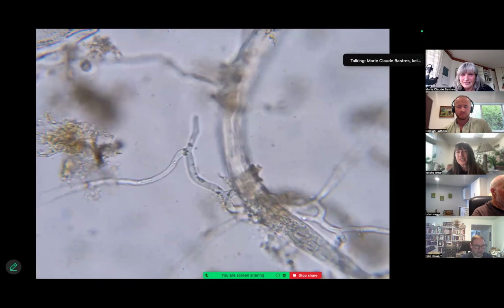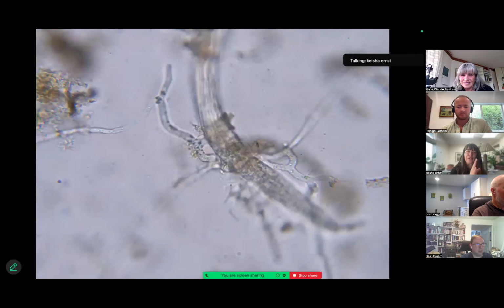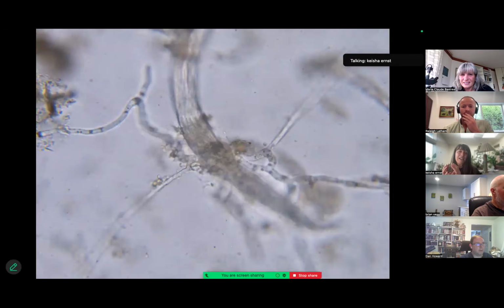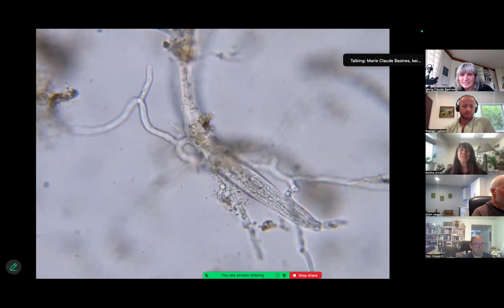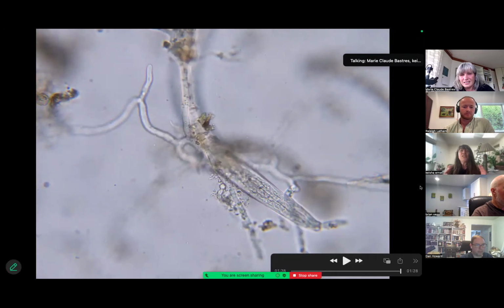There is not a good and bad. We've got to get away from that. There's no good guy, bad guy. There's diversity, and that's good. We looked through her compost and saw so many different shapes of fungi, so many different shapes of testate amoeba, lots of nematodes, and flagellates zooming around. That's what we can trust and say is good. Wow, this is a great ecosystem.